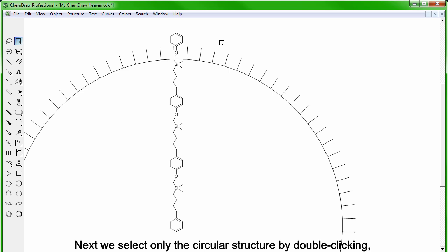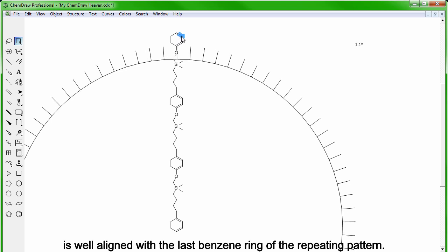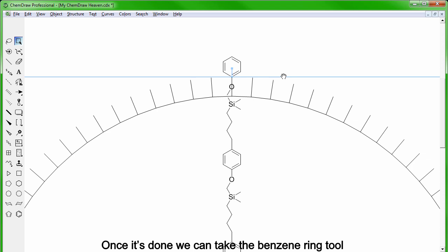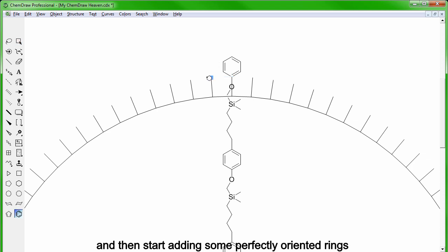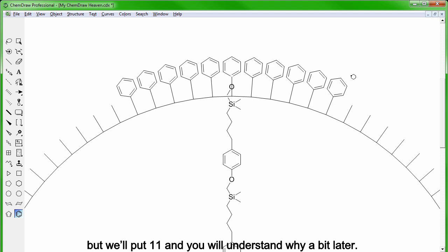Next we select only the circular structure by double-clicking and rotate it so that one of the branches is well aligned with the last benzene ring of the repeating pattern. Once it's done, we can take the benzene ring tool and then start adding perfectly oriented rings that will be on the outer shell of the dendrimer. Normally we would only need 9 of them, but I'm putting 11 of them and you will understand why a bit later.